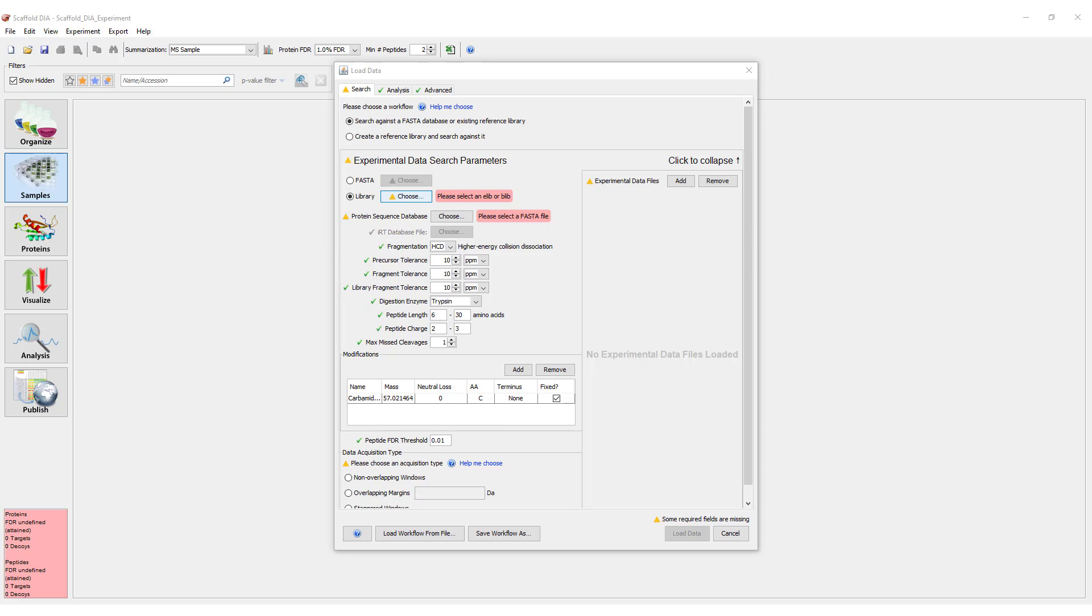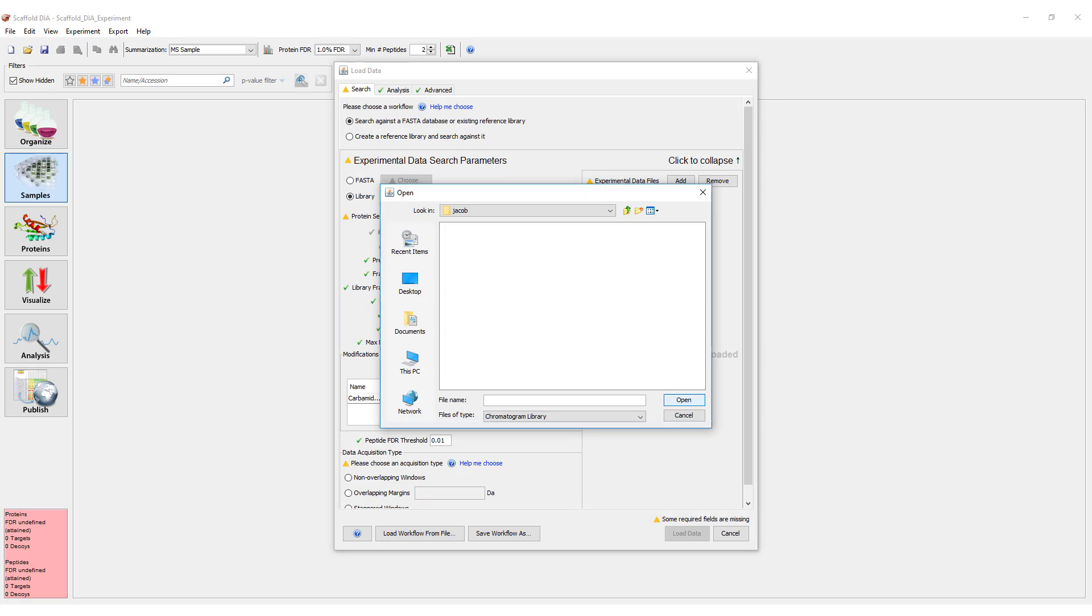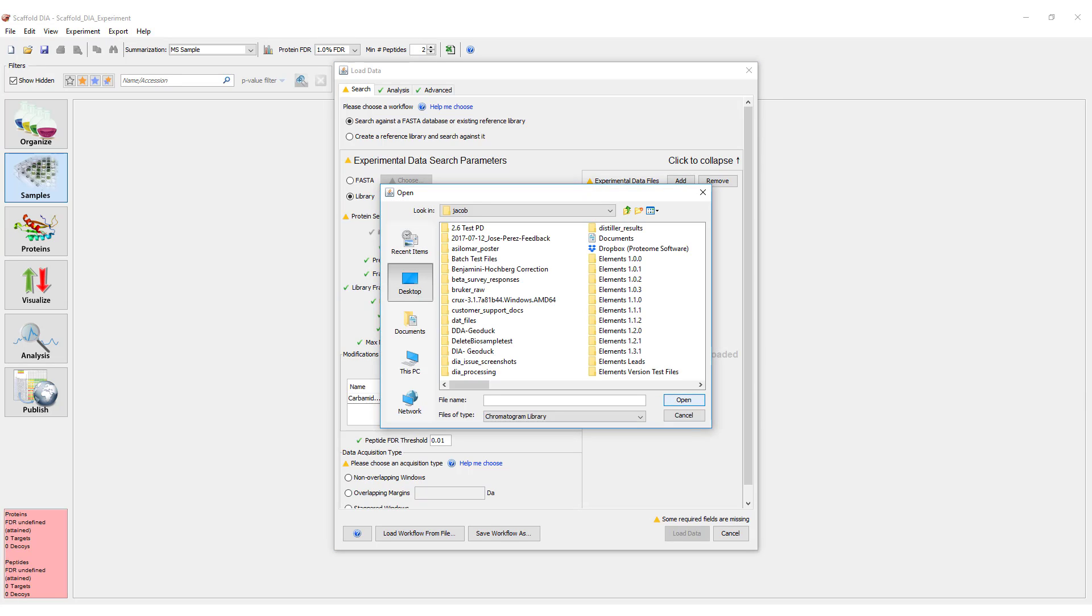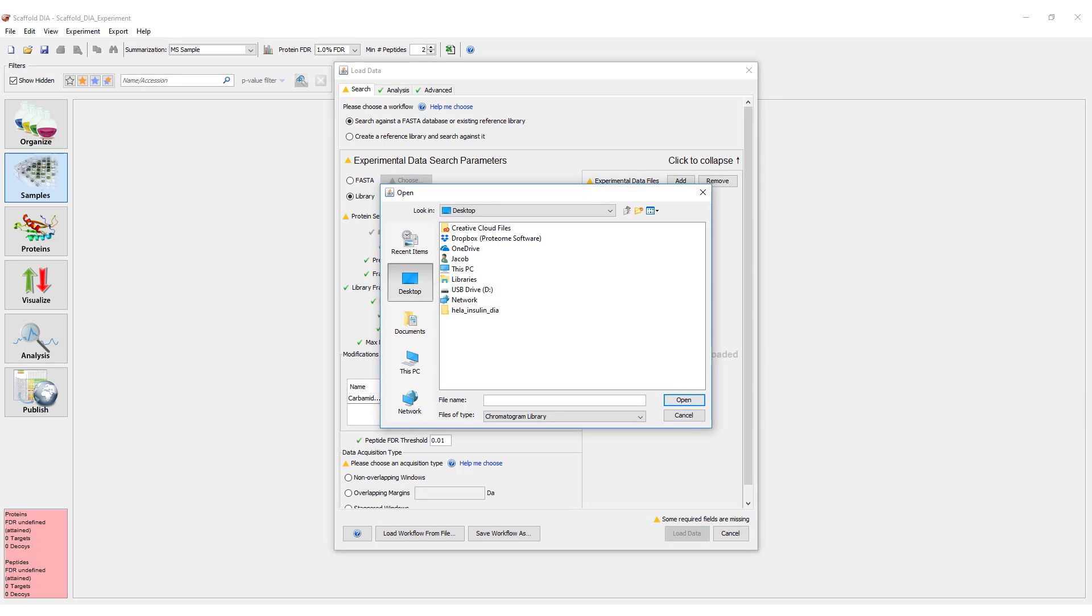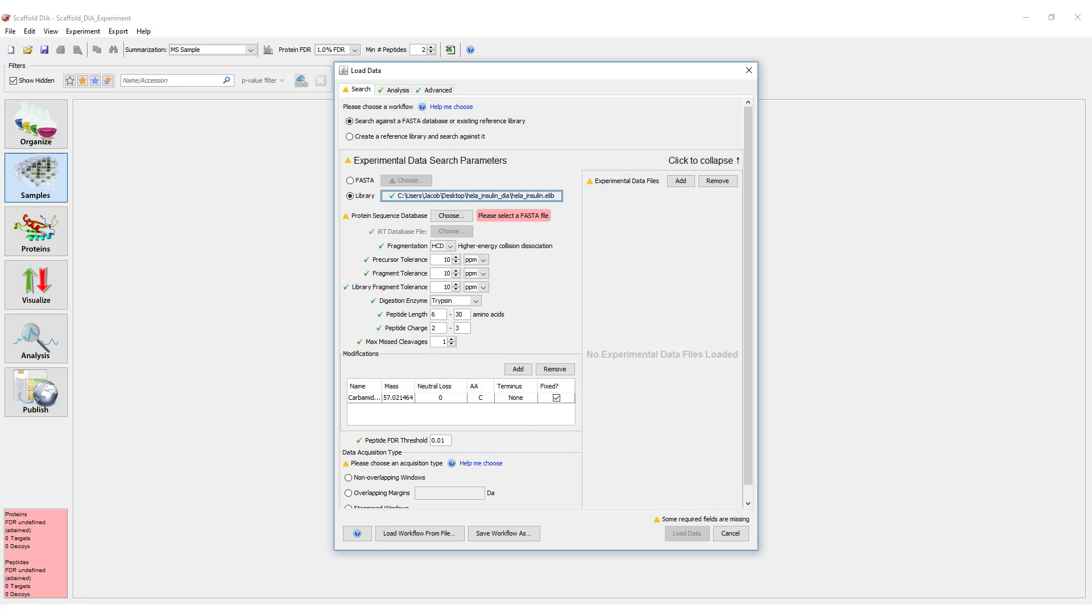In this tutorial, we are going to search experimental data against an existing ELib. Use the file browser to select your library. Next, select a FASTA file for the organism being studied.